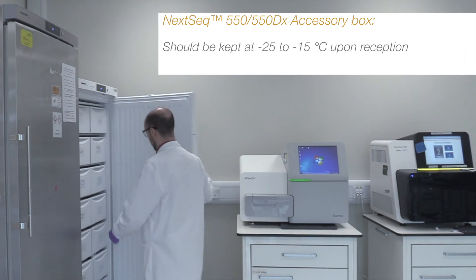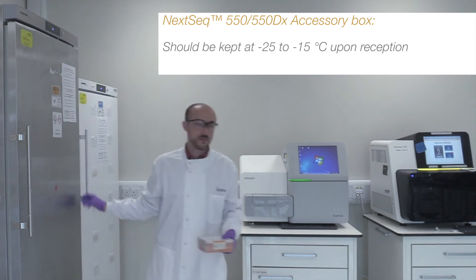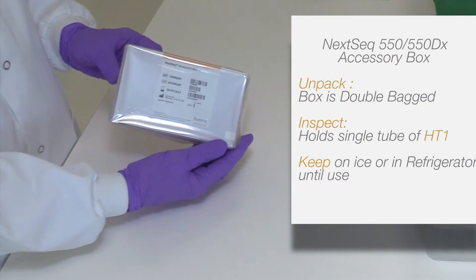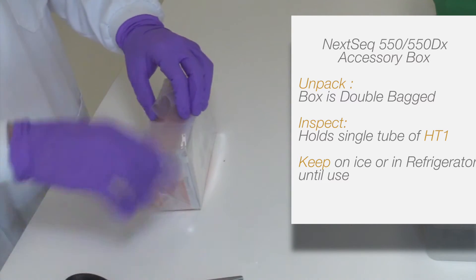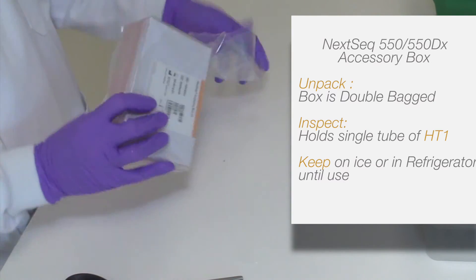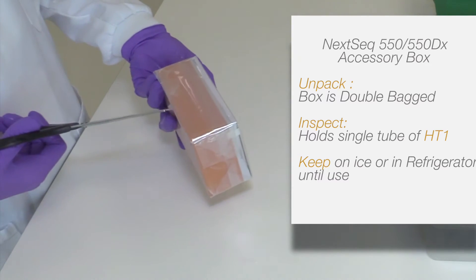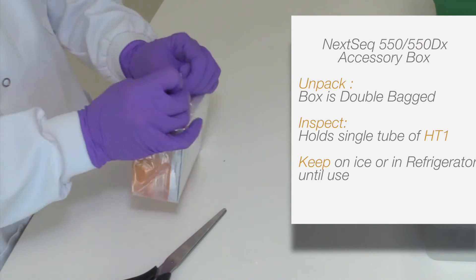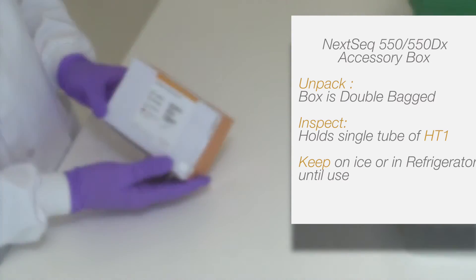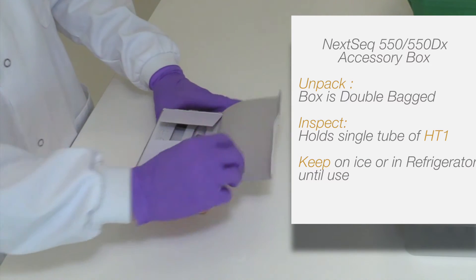Next, remove the NexSeq 550 550DX accessory box from the minus 25 to minus 15 degrees Celsius storage and unpack it by removing the box from the two layers of packaging containing it. This box holds a single tube of HT-1. Please defrost this tube and place it on ice until use.